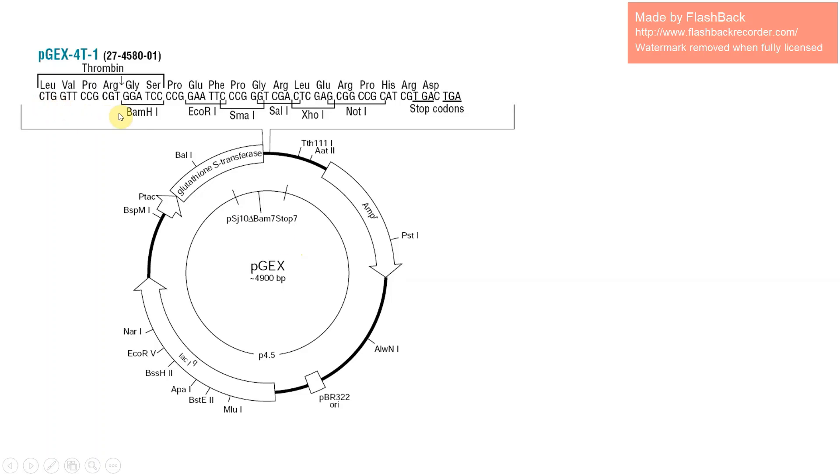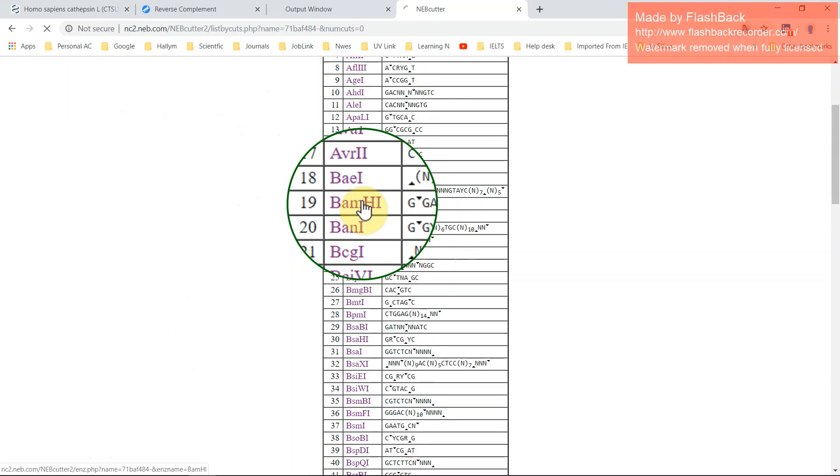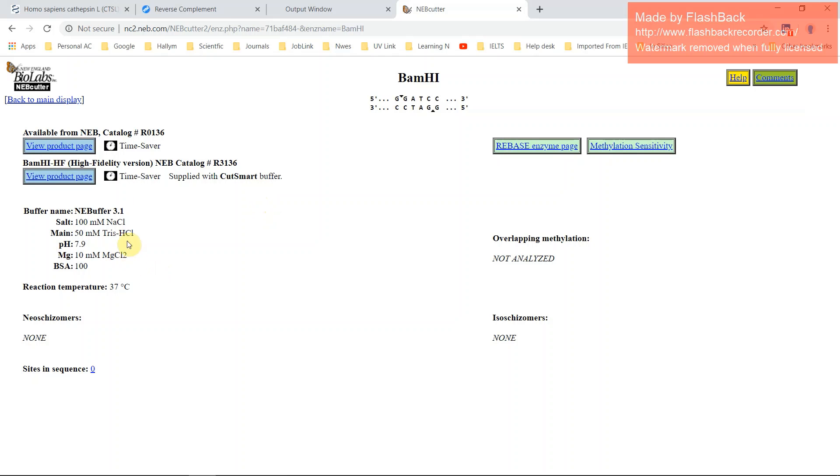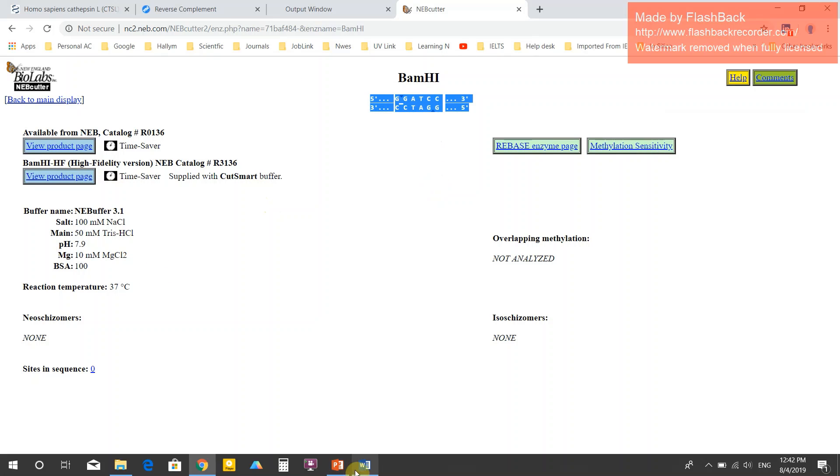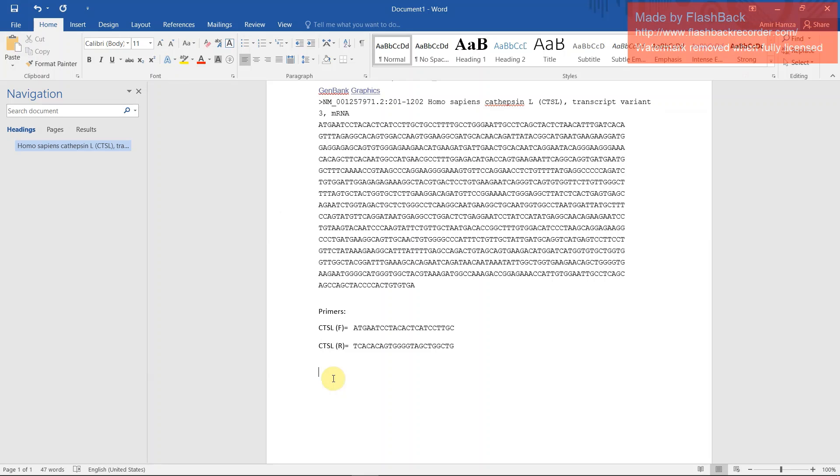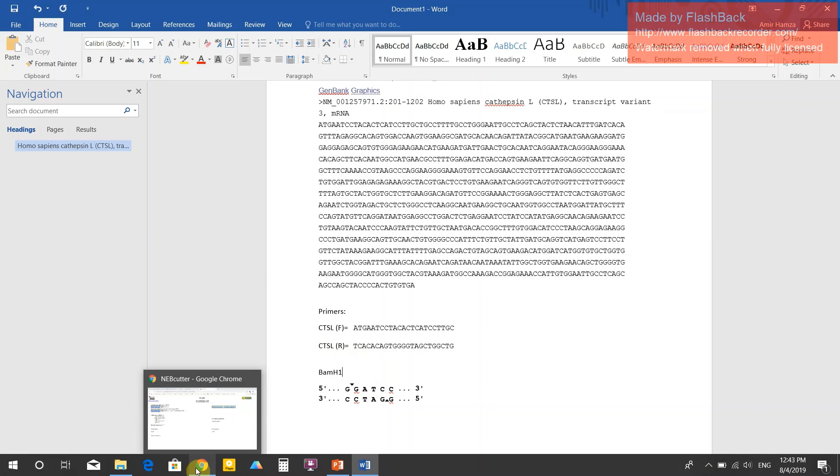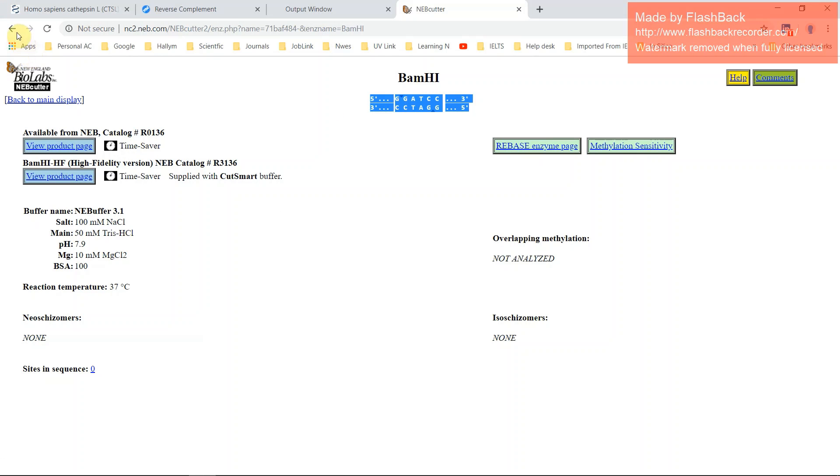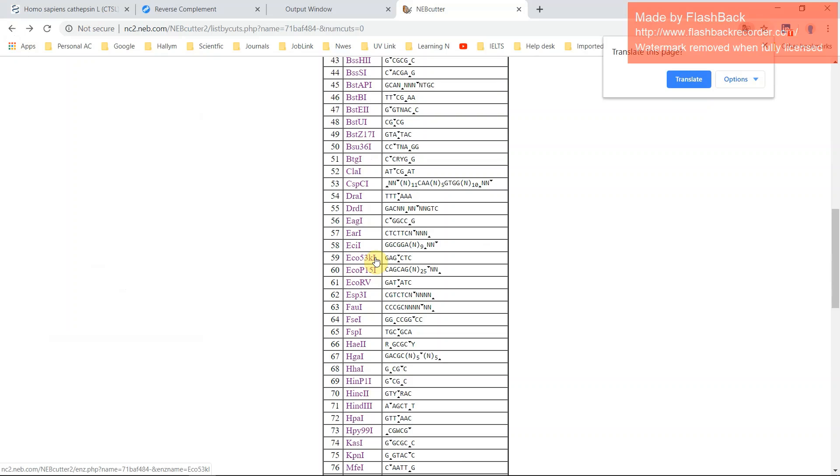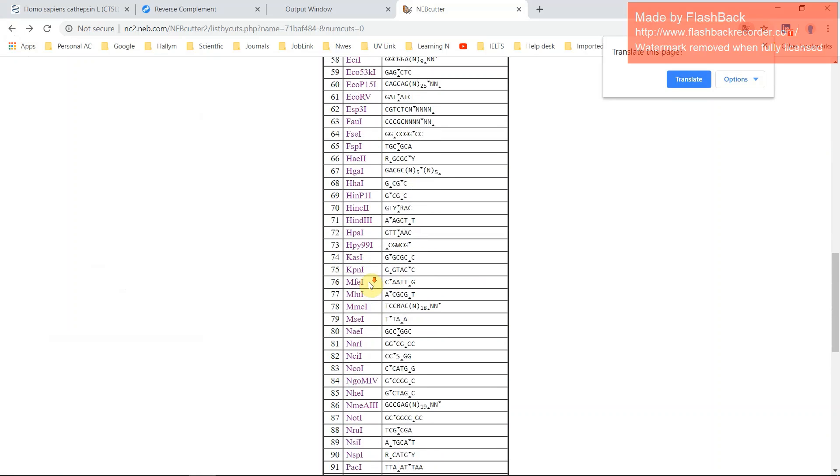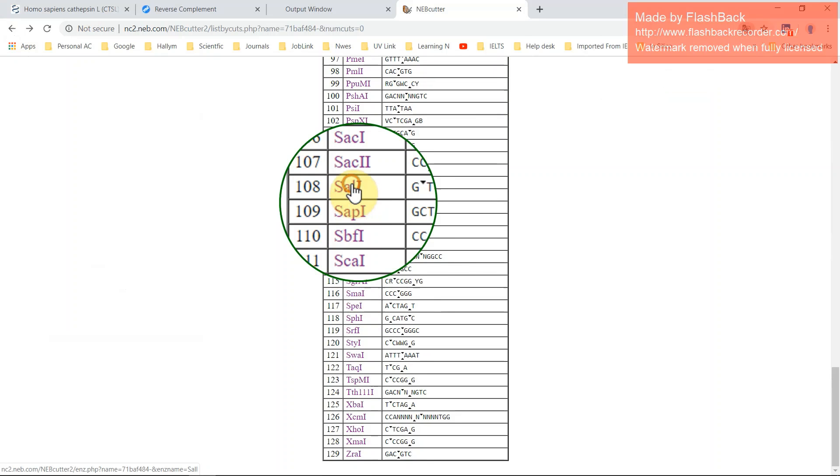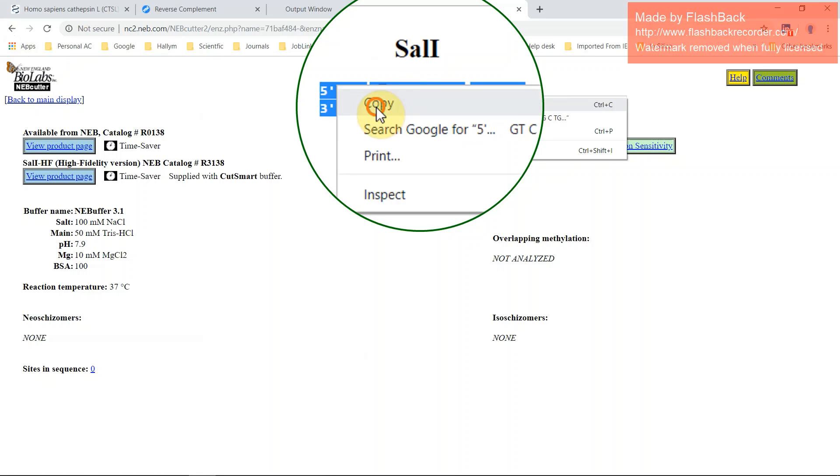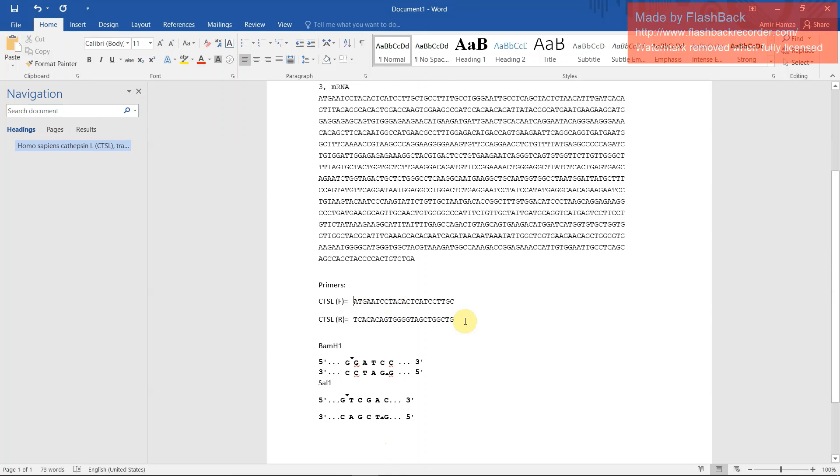You see here there are several restriction sites. According to this, you have to design your primer. So here BamHI, EcoRI. You have to find here BamHI. Yes, first enzyme is BamHI and this is the sequence. This is the BamHI site for the forward primer. For the reverse primer, I will search another EcoRI. Here is EcoRI.